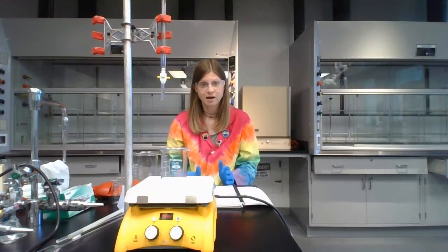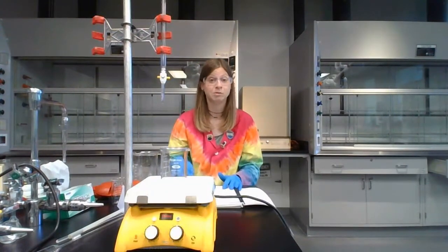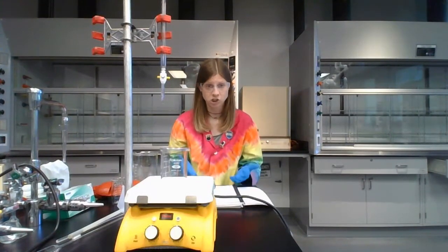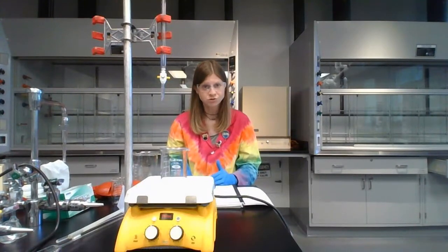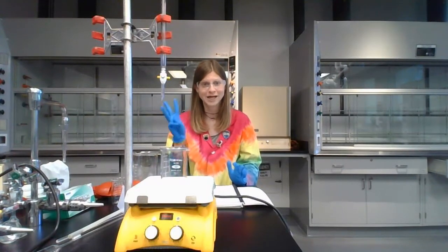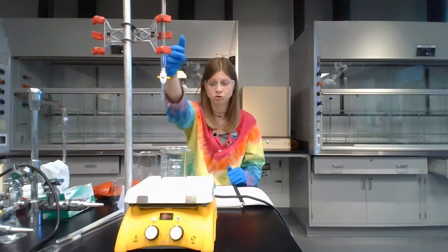So the two reactants for this lab are sodium oxalate, where the oxalate is the thing that's reacting, and potassium permanganate, where the permanganate is the thing that is reacting. But this reaction has to occur in acidic conditions. So instead of water, 1 molar sulfuric acid is used to dissolve the sodium oxalate. So the three chemicals we're using are sodium oxalate, which is a solid, sulfuric acid, which will dissolve the solid, and potassium permanganate, which will be in the burette.